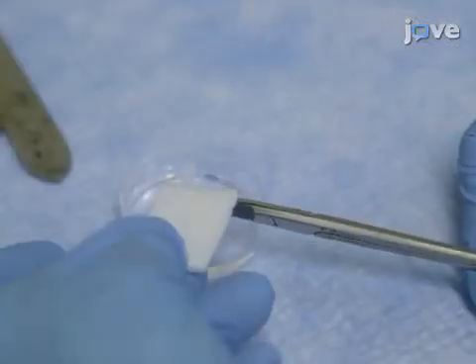Then, cut small pieces of gel foam into a sterile petri dish containing 0.9% saline.